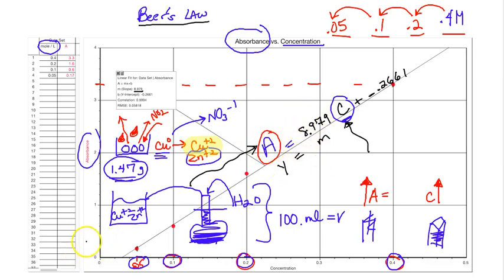So we actually measured in the lower left corner what the absorbance was. And let's pretend that I'm a princess, and the absorbance was, let's say, 1.63. I'm just making numbers up. That's the absorbance. So you just put it in the spectrophotometer and read that. And so the absorbance of my solution, and this would be in your data table, was 1.63. And the grams of my solution, okay, this is important, is here. This is an important value here.